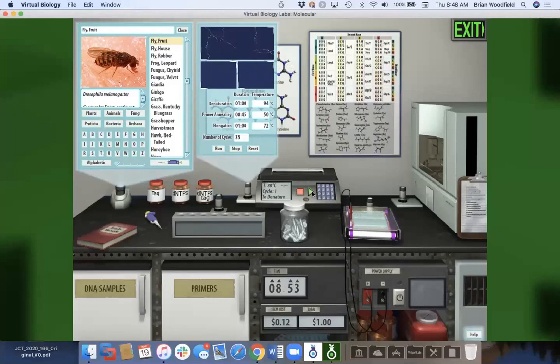So Brian, could you show one of our forensics type worksheets? Right, because this is kind of overwhelming to a high school student, how much is here.